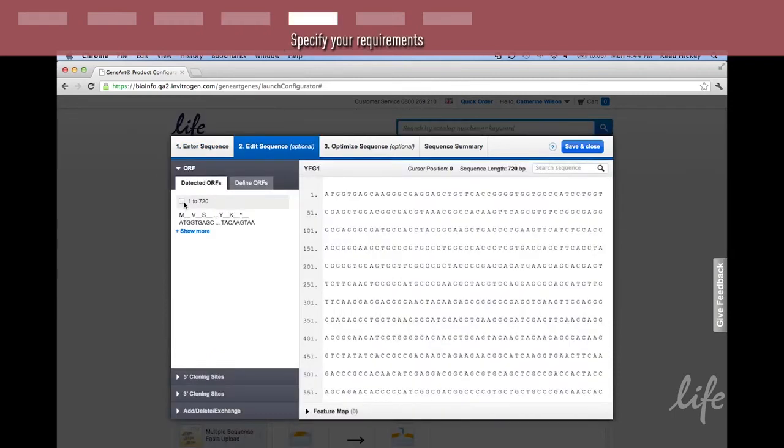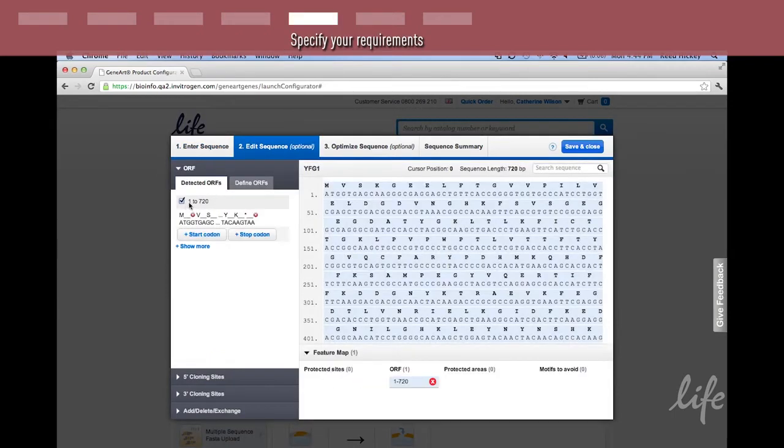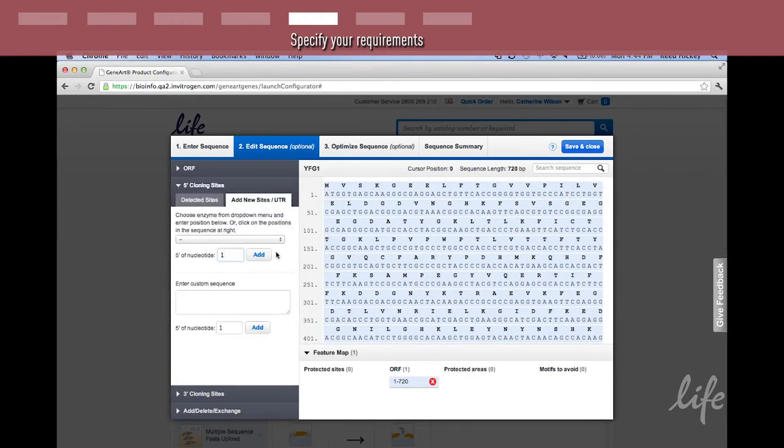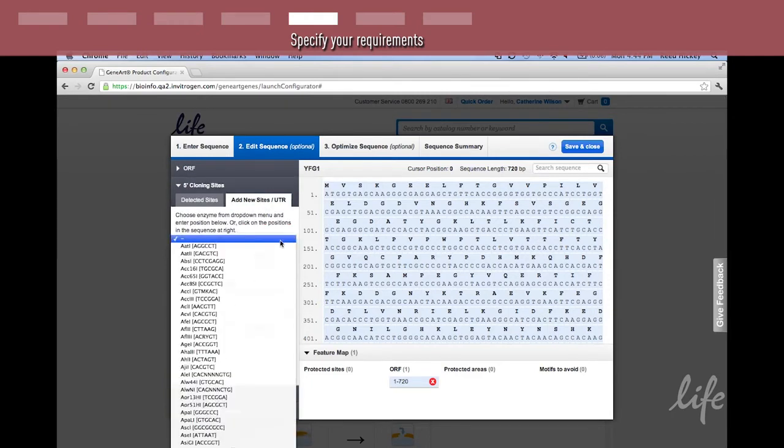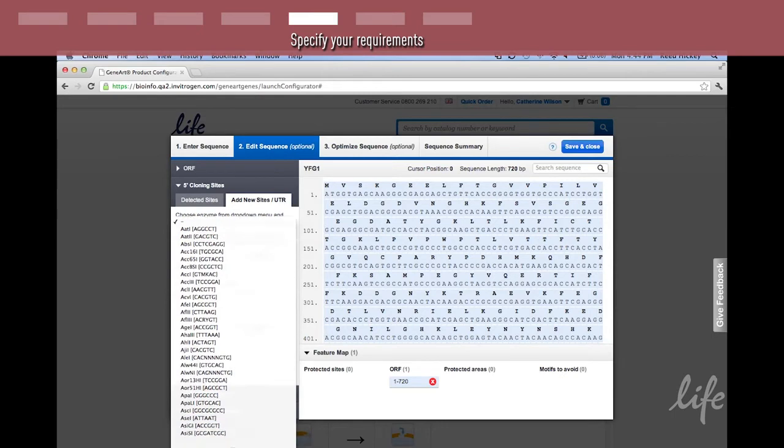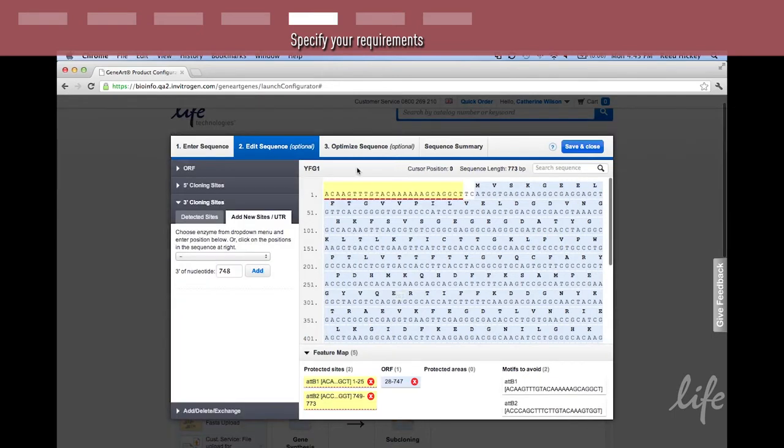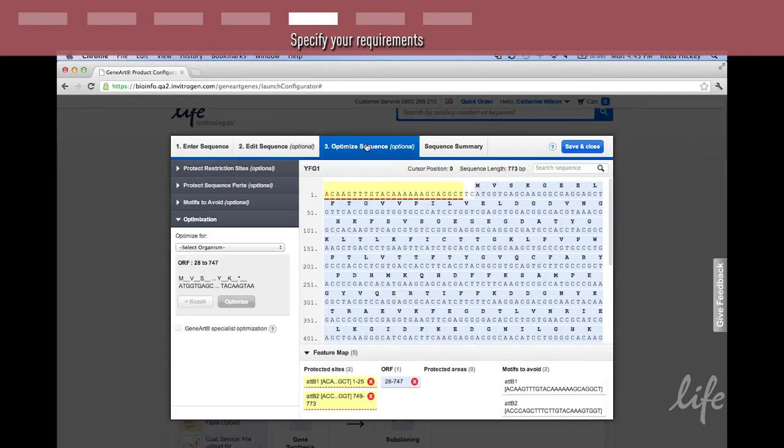The gene synthesis portal selects the open reading frame for you. You can pick from the list or define an open reading frame for yourself. At this point, you can add additional features to the sequence. Proceed to the next step.